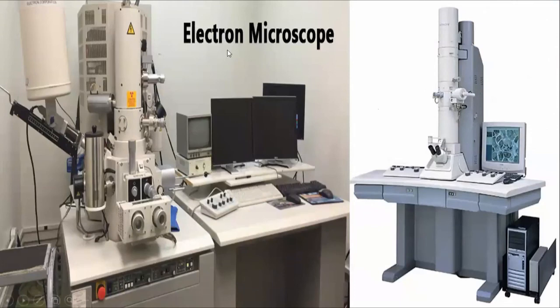Here we have two pictures of an electron microscope. You can pause the video and take a good look at it. As you can see, it looks like it has a lot of parts when compared to the compound light microscope, right? So just take a look at it.